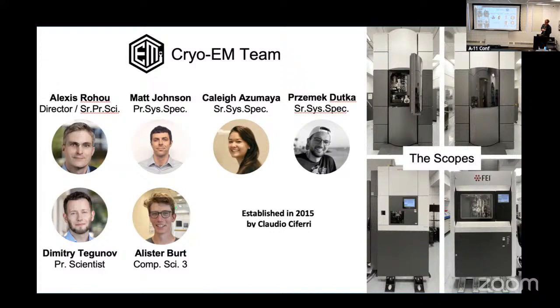We've got Matt, Kaylee, and Chemek, who work on the more facility side, running the microscopes and making sure they're performing as well as possible. They also do a lot of sample prep and a lot of data analysis. So it's not just a run-the-microscopes kind of position. It's really a full 'let's give this department and this company Cryo-EM as a solution' kind of thing.